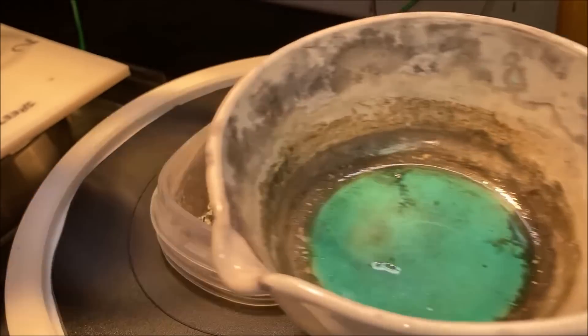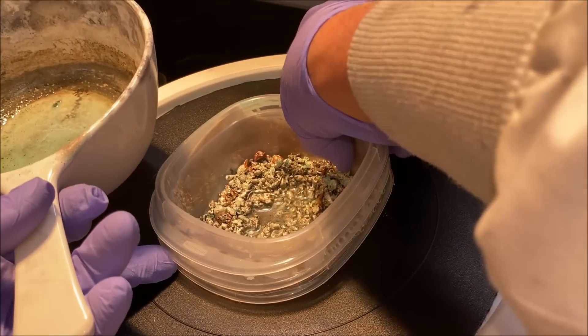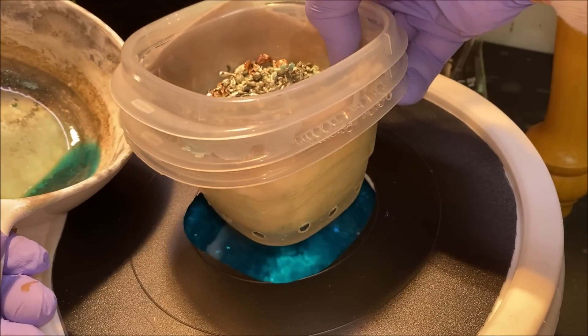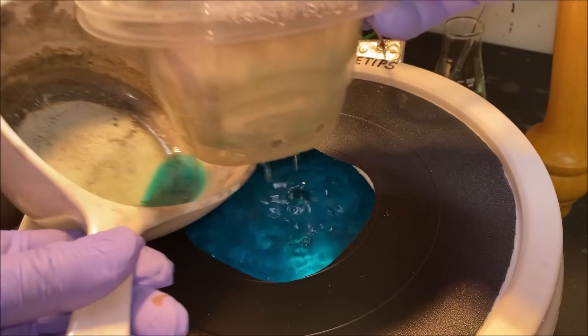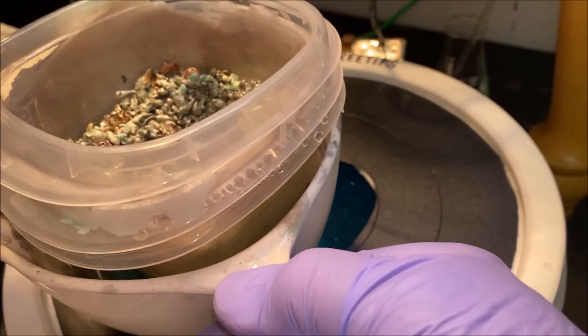Let's see if we can get this anode basket out of here now. Should be able to just pick it straight up, put it in this jar, and then we'll get this out of the way.